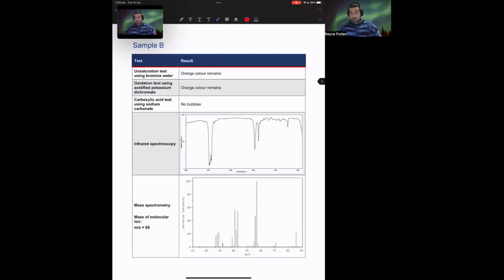Now, this is the first one that I'm recording, so there are a couple of times where I'll explain a little bit more than usual, but otherwise in my later videos, I'll be a bit quicker because hopefully you'll start at the top and you'll work your way downwards. Now I'm starting with sample B. I'm going to assume that you've seen Stephen's video on sample A, but if not, maybe check that out first before moving on to others.